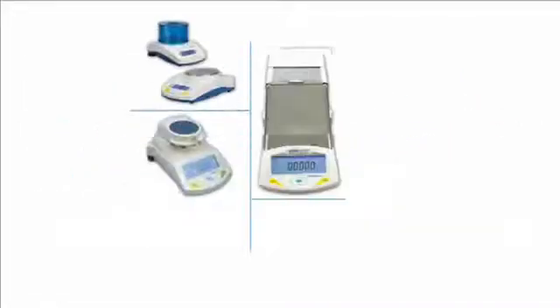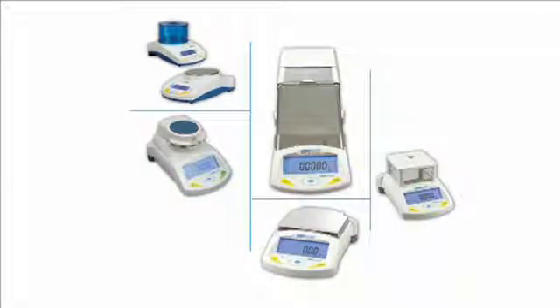Welcome to Adam Equipment's Video Training Series. This video will provide an overview of Adam's Moisture Analyzers, the PMB series. Let's take a look at them now.